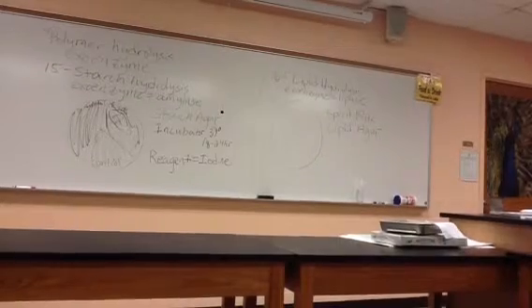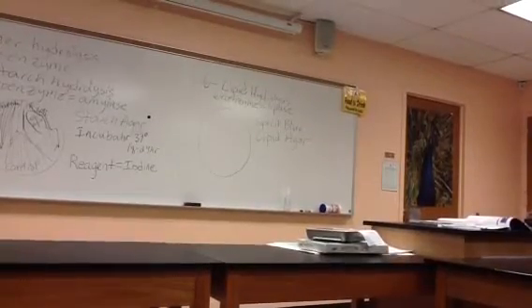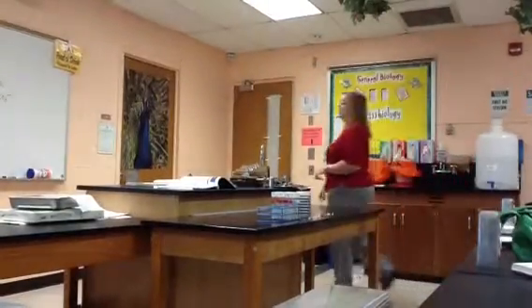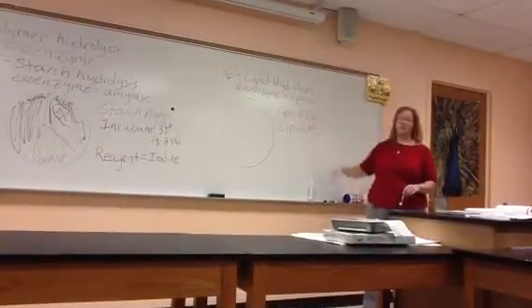It is actually blue. It's one of our prettier agars. Nice blue color. Spirit Blue is a dye, a stain, like crystal violet, safranin, and methylene blue. Okay, so Spirit Blue is just another dye. And it's been applied to the fat. So the reason it's blue is because all the fat in the plate has been stained blue with Spirit Blue.